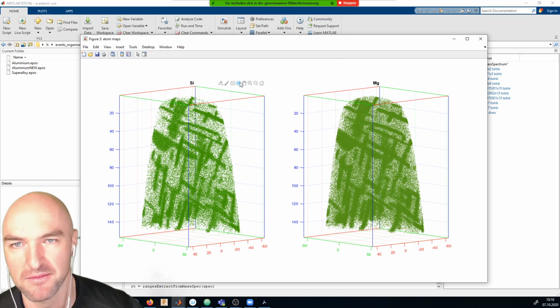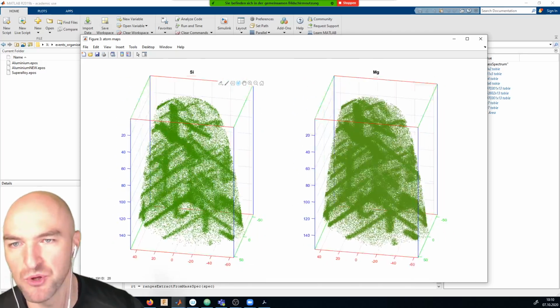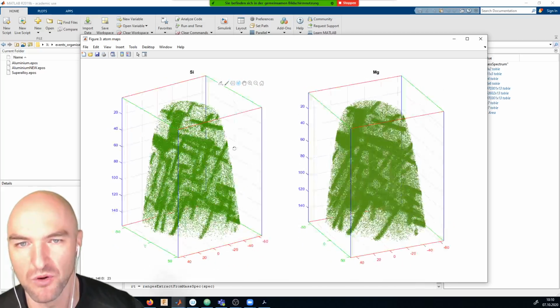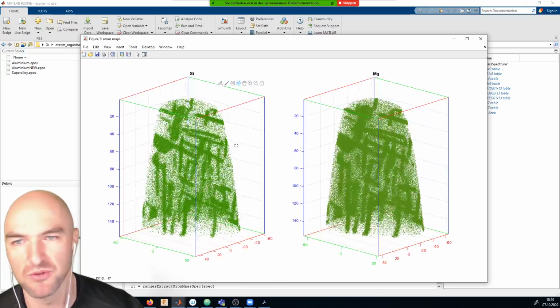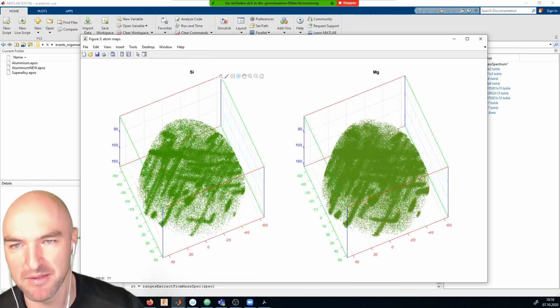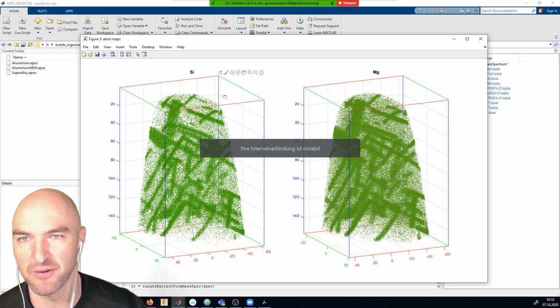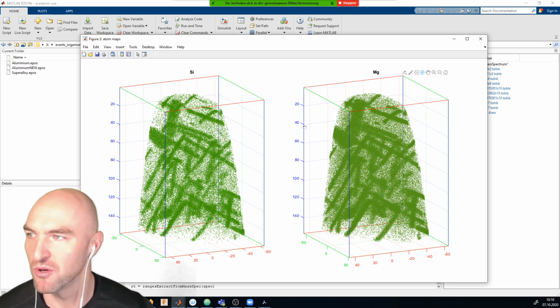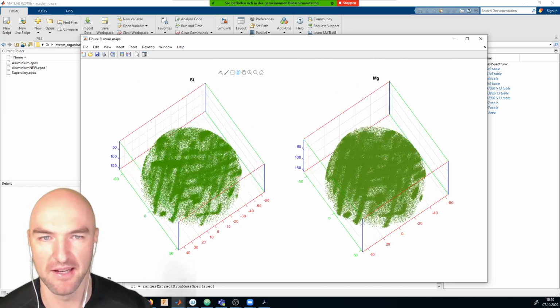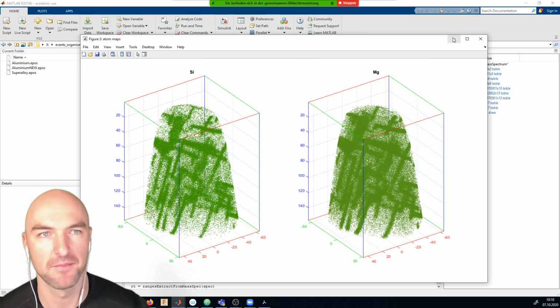And then you can do everything that you're used to, rotate stuff around. We usually plot things in multiple windows, and we have those windows connected so that they're always the same orientation, and you can do nice animations. And one thing you can already see is that maybe the color scheme is not quite optimal because you can't see the difference between the silicon and the magnesium all that well, because they're almost the same color. But this is easily fixable. You can just go into the color scheme and change that.